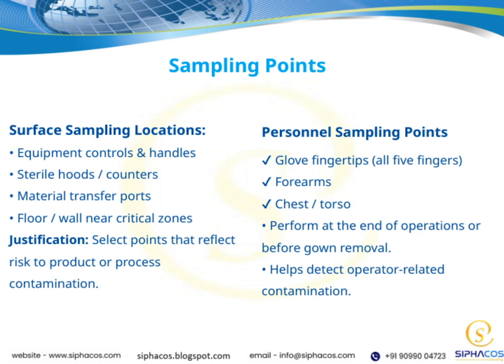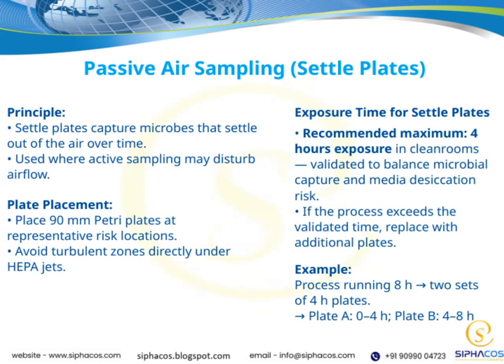Let's talk about the exposure time for settle plates. The recommended maximum exposure in cleanrooms is 4 hours.